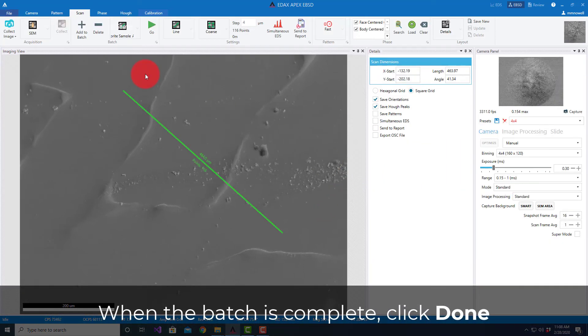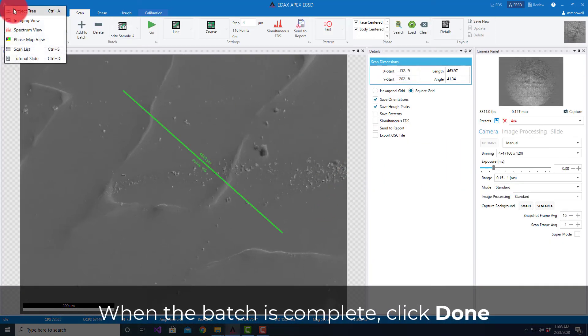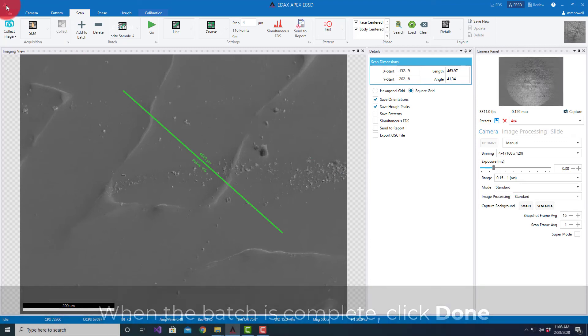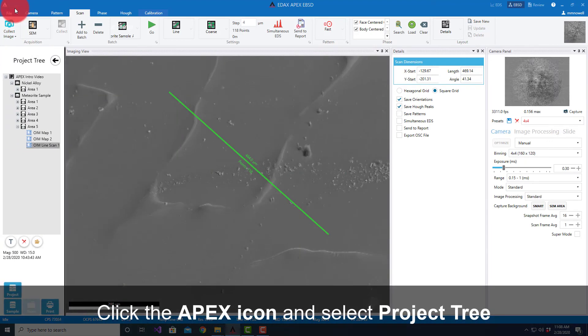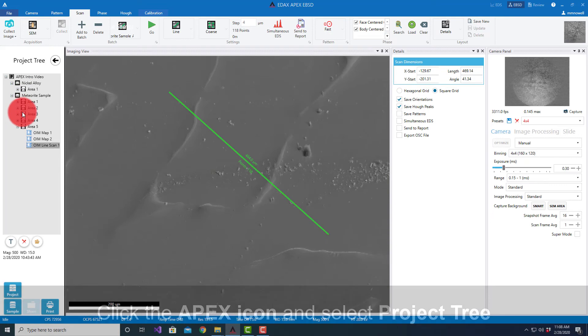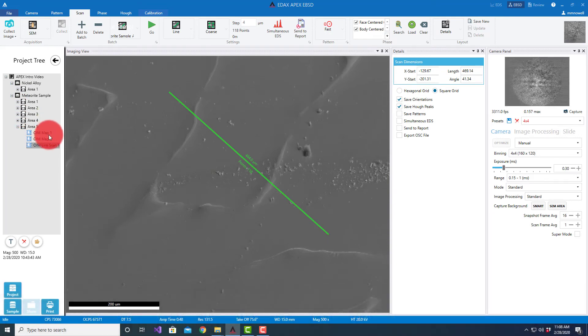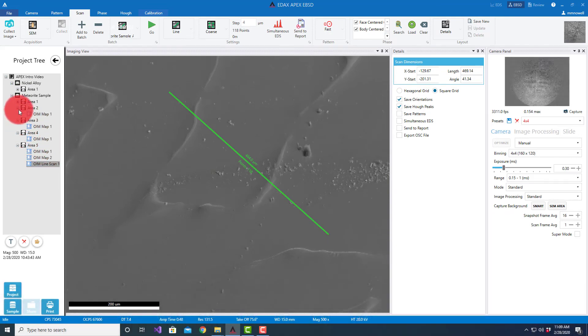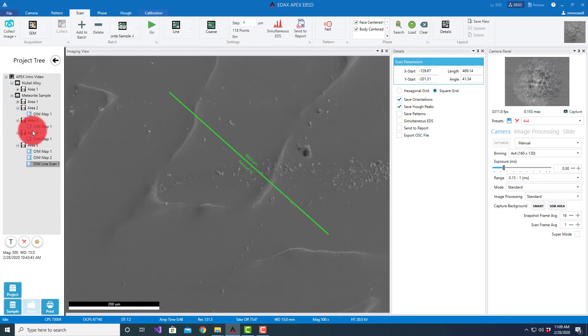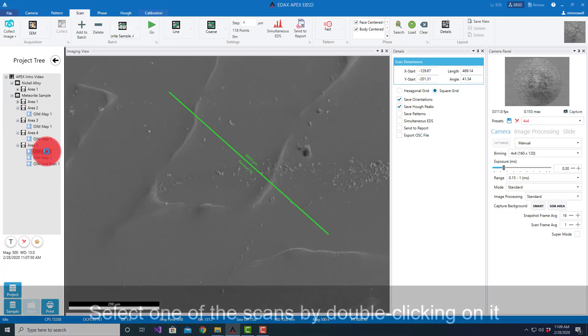I can hit Done and I can look at the project tree. Here you can see it's filled in these areas of interest to show I did two maps and a line scan at one area. All those are here, and if I wanted to select one I can just double-click on it. It'll send that to OIM Analysis.